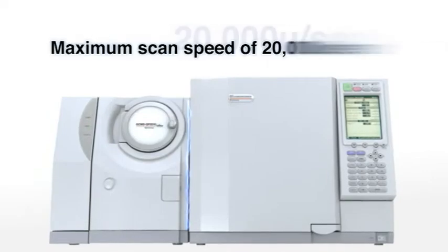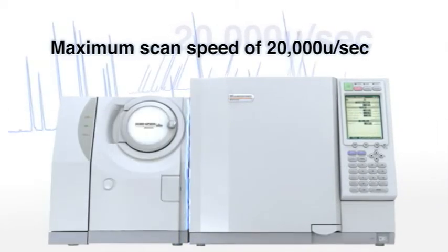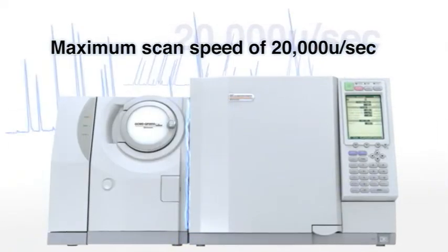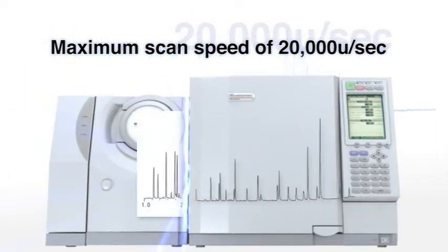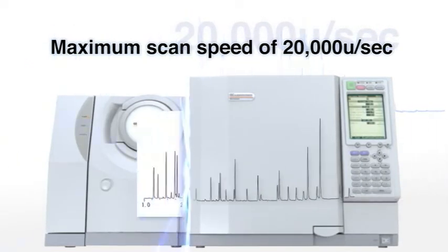This achieves maximum data acquisition speeds of 20,000 AMU per second and results in a level of sensitivity more than five times better than that of older instruments.